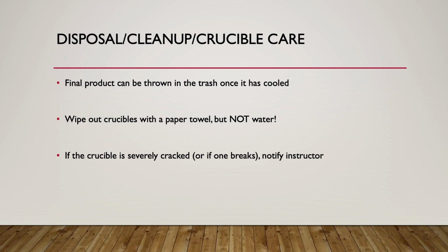It's not a big deal if you do drop something and it breaks, although do try to take caution. If anything does break, or if you're worried that something is going to break because it's already cracked before a trial starts, please just notify your instructor and show it to them to take a quick look. We can get it switched out. If you do need to throw away a broken crucible, make sure it goes into the glass waste, not a normal trash can, because those ceramics, especially if they're broken, are likely to have sharp edges, much like glass would.